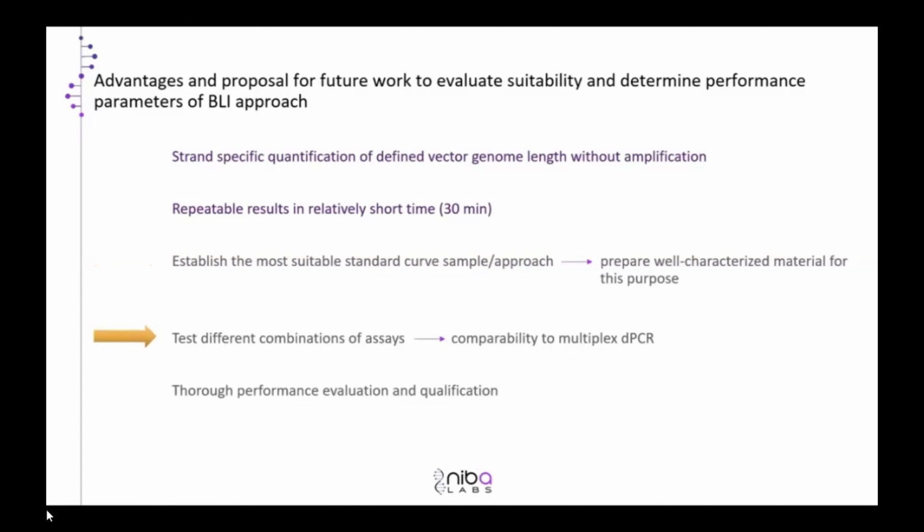Of course, the comparison is slightly challenging because of the strand specificity. However, by using the well-characterized standard material, we might get even more information from the BLI assay. And in the end, of course, we would need to thoroughly evaluate the performance and perform the qualification of such assay.